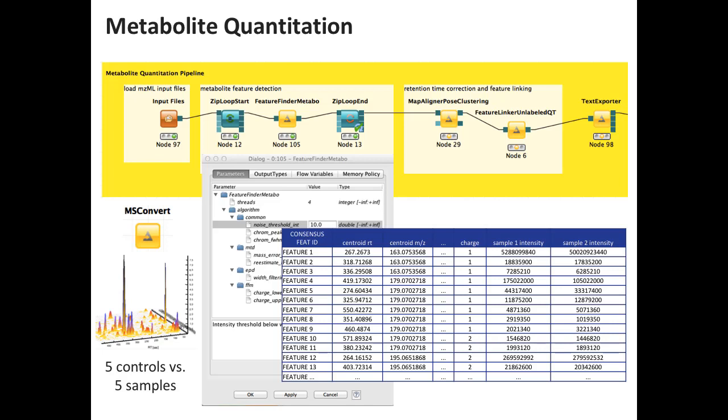Shorter peptides, yes, but longer peptides have isotope profiles that look very dissimilar. So we actually have a version that we have been using that has an internal averaging model, and that works okay as well. But is that because of the peak training model that you used? Yeah, of course. But there actually you don't need to train it. You just plug in the averaging model and you're fine.